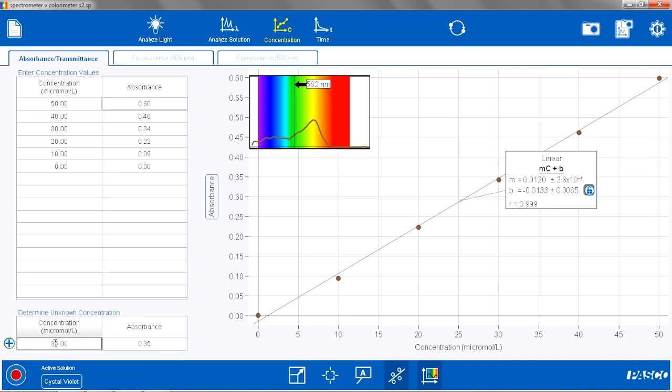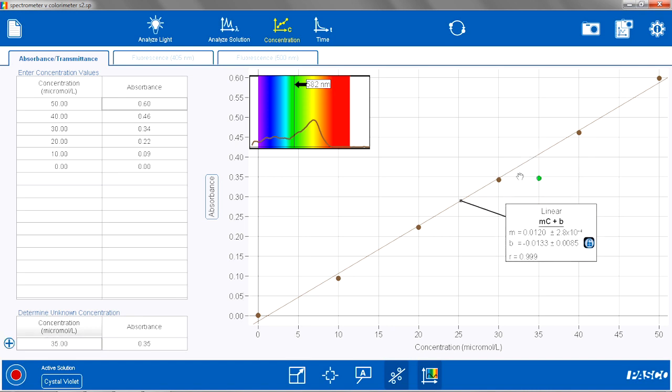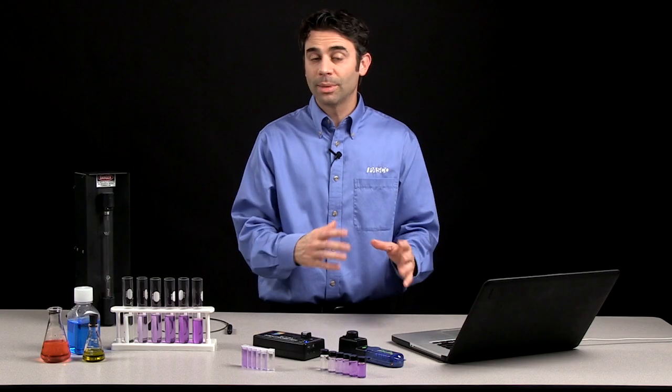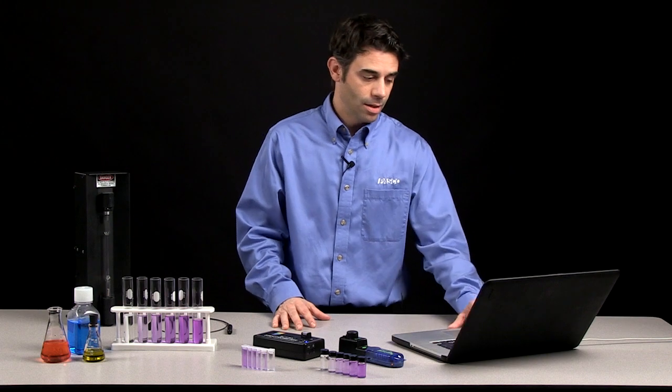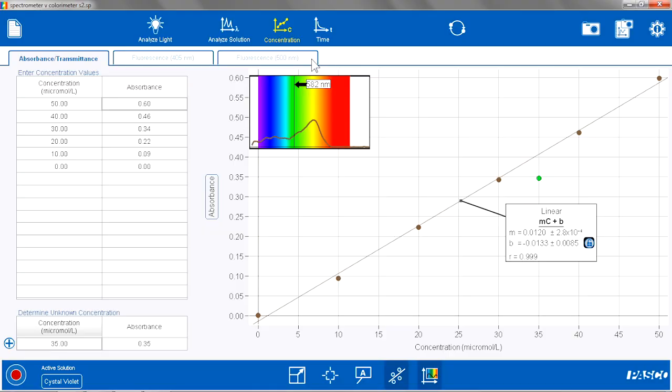And then that unknown value is automatically added to the graph, and the students can get an idea if their estimation or calculation was correct, so they get a little bit of student feedback. The other nice thing about this page is that there is a built-in live scan, so you see the full spectrum at all times. So you can see that full spectrum changing.